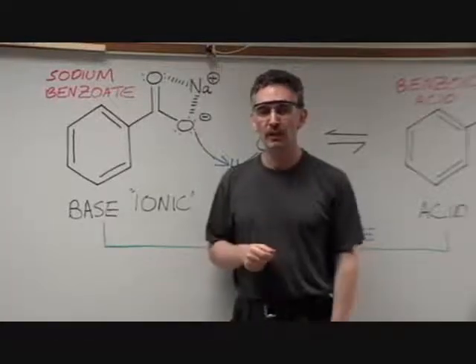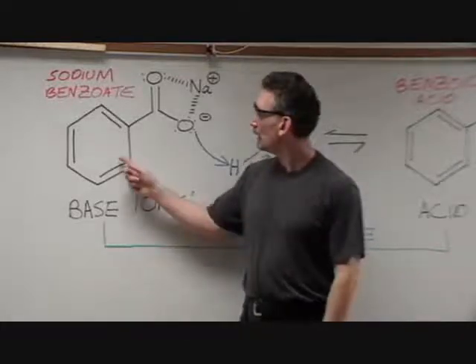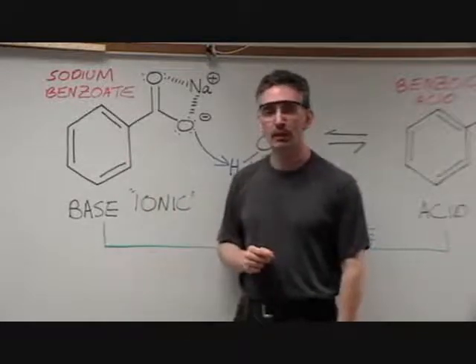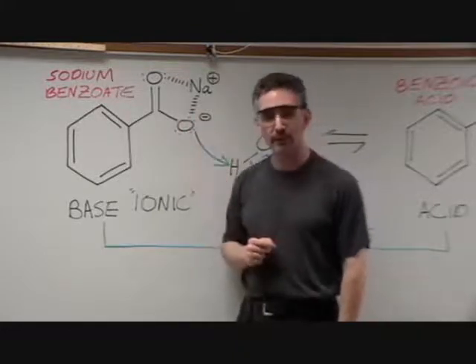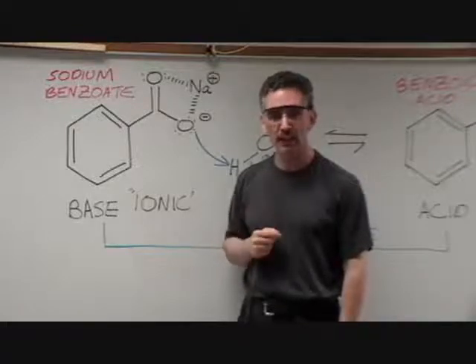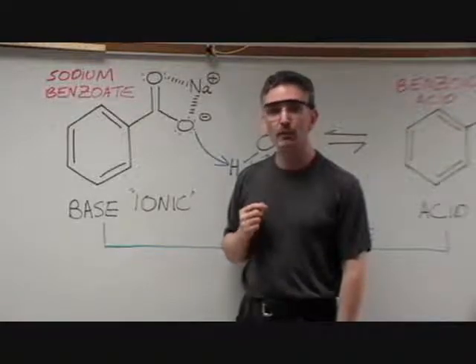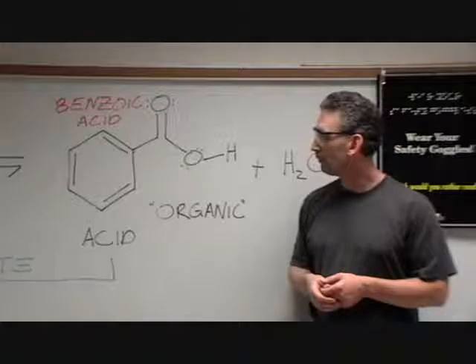So what do we know about this pharmaceutical company's preservative? It's an organic compound, but it has formed a complex to a sodium ion. So the sodium benzoate does have some ionic character, which is going to make it soluble in water and insoluble in organics like dichloromethane.